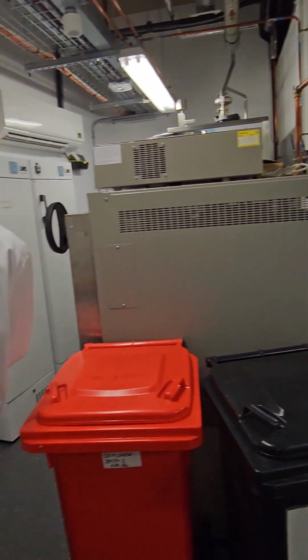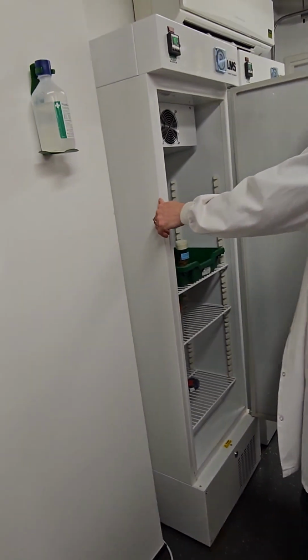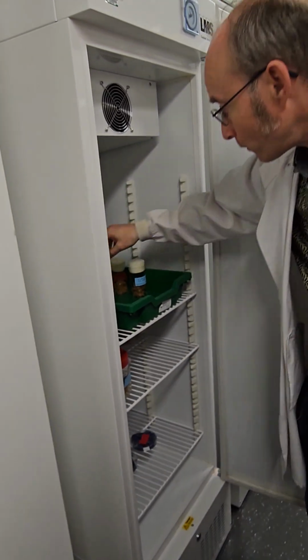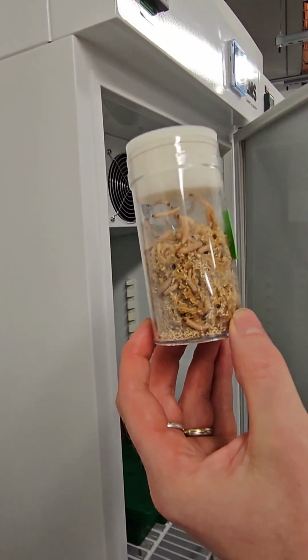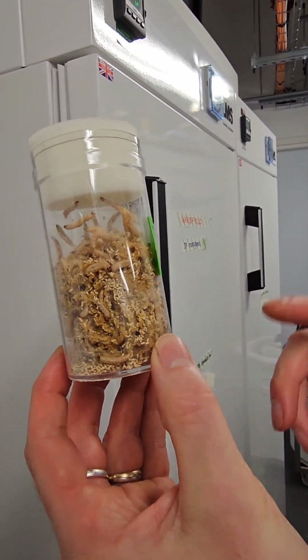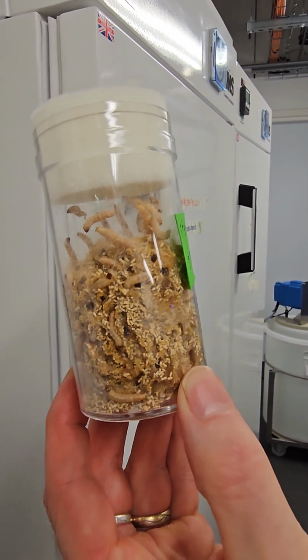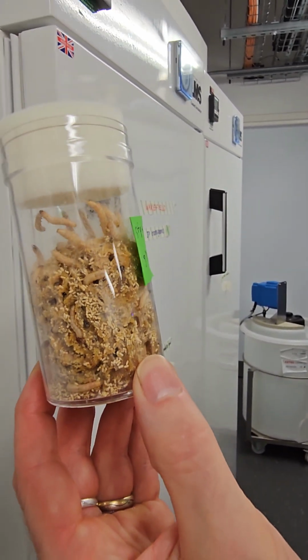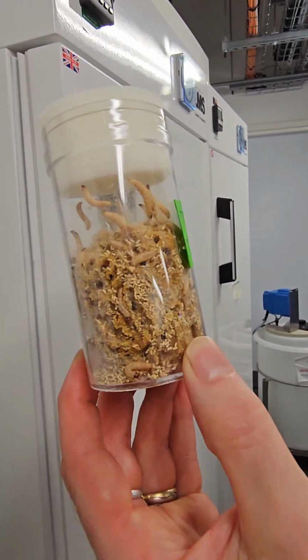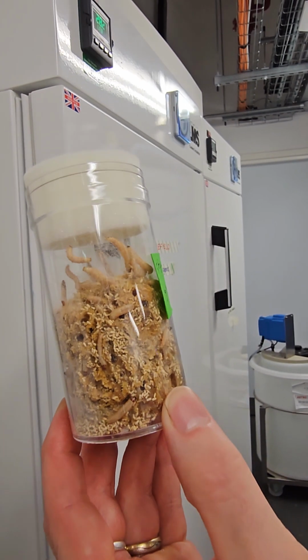So, our moths. This is a modified example, similar to the flies. We have a source of food, which is again a mixture of a carbohydrate source like maize and flour, but this one has honey in it, because obviously they like honey. They come from the hives.